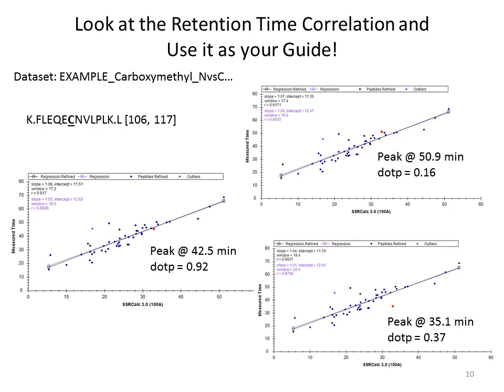So it's just, again, more evidence, like, if it looks like a duck and it quacks like a duck, then... and this one is far away. Now, there are cases where you're going to see things that don't jive so nicely, and the dot product might be low, but it adheres to the retention time line, or vice versa. And that's just because nothing's perfect, unfortunately.